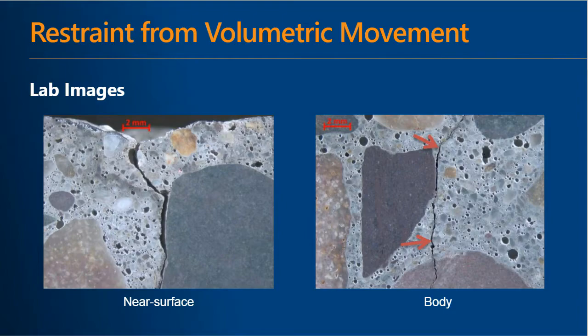When we look at another set of images, again, we see that there's no clear propagation pattern, but we can begin to rule out different cracking mechanisms. So we think, okay, did these look plastic? Maybe in the left image where the crack begins at the surface of the concrete and it tapers with depth, but then we look at the right image, which was taken deeper in the lap section of the same sample, and we can see that the crack breaks an aggregate particle at the bottom of that image. This means that the concrete had gained appreciable strength when the crack propagated.